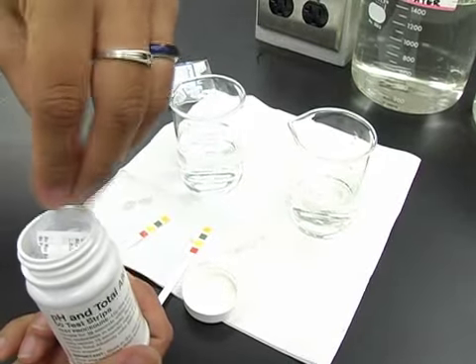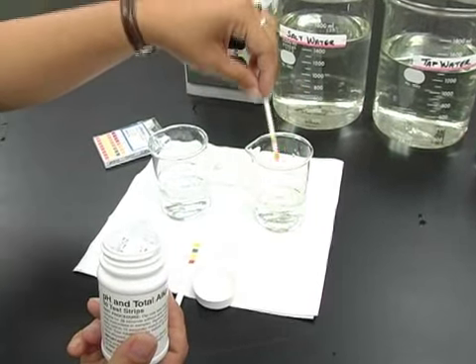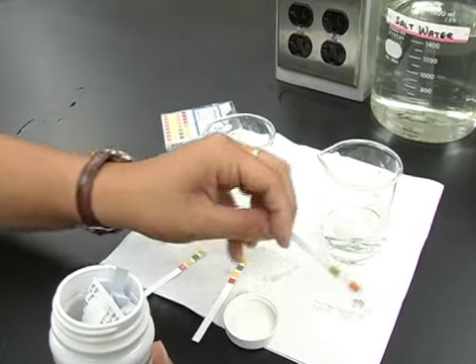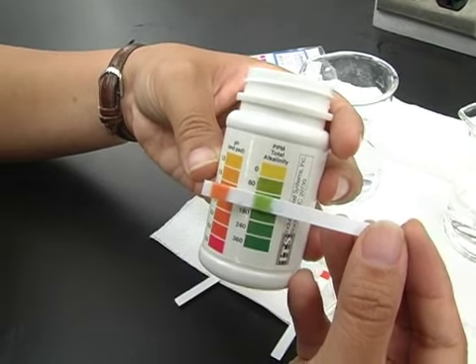To test for pH and alkalinity, take one of the test strips and dip it into the water sample for 10 seconds, trying not to agitate the water. Remove, blot, and immediately match the pH color. Then, match for alkalinity. Record your results.